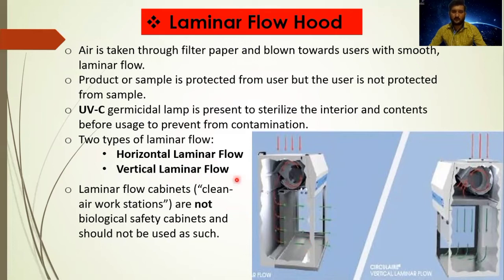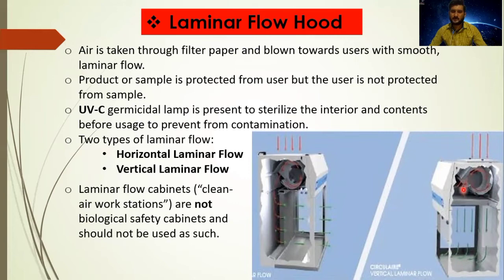In the vertical laminar flow hood, instead of horizontal air flow, there is vertical air flow — hence the name vertical laminar flow. The blower draws air from the environment; the filter paper is located at the top of the cabinet. Air passes through the filter paper via the blower and falls vertically onto the sample or product — that is why it is called vertical laminar flow.